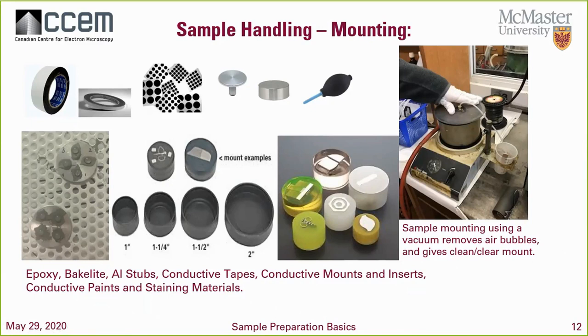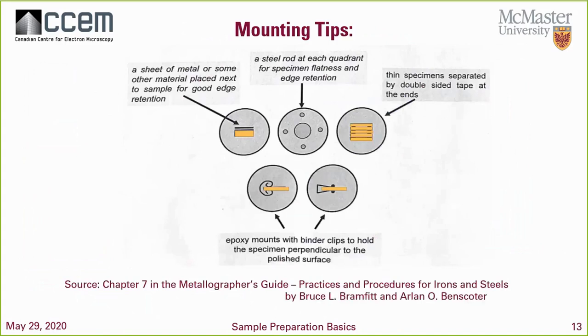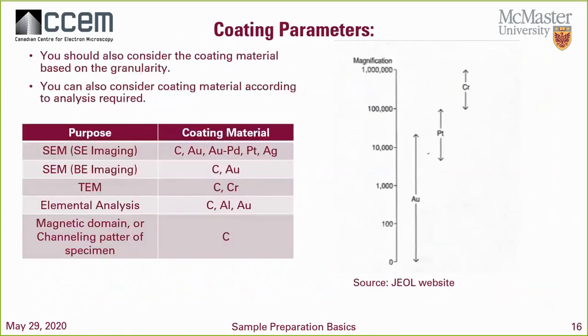Okay, you mentioned coating, and the next question is actually about coating. What is the typical thickness of coating, let's say gold palladium alloy? How do you measure the thickness?